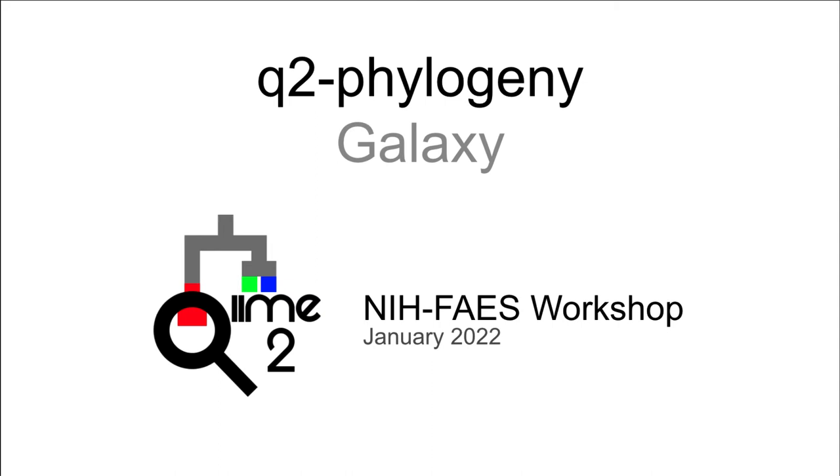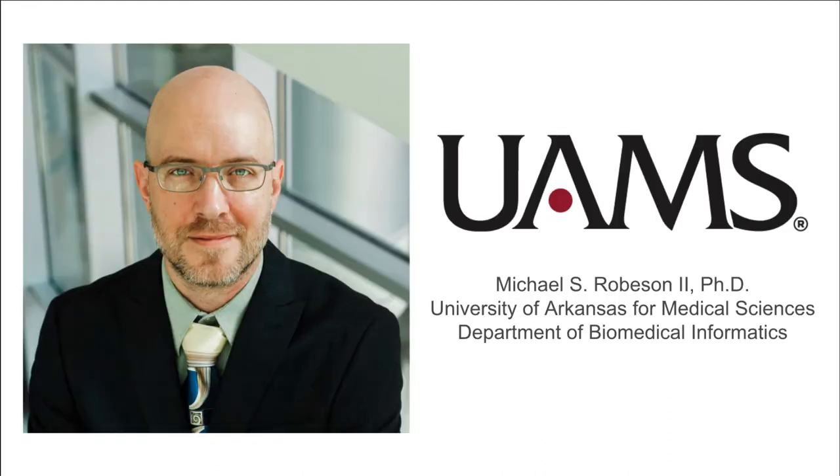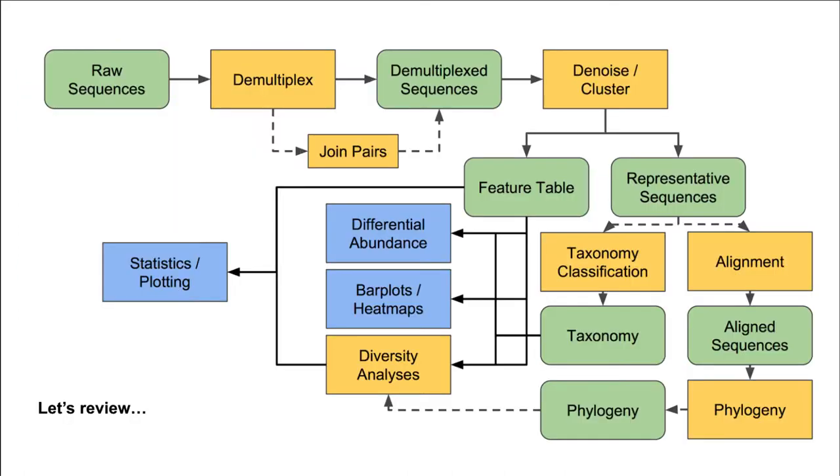Hello everyone. In this video, we will learn how to use the QIIME 2 Phylogeny plugin using Galaxy. My name is Mike Robeson, and I am an assistant professor at the University of Arkansas for Medical Sciences in the Department of Biomedical Informatics. Before we proceed, let's revisit what we've done so far.